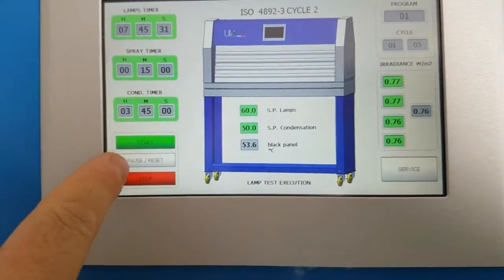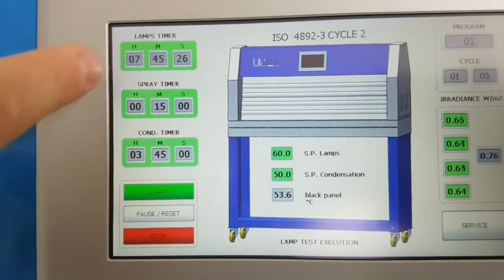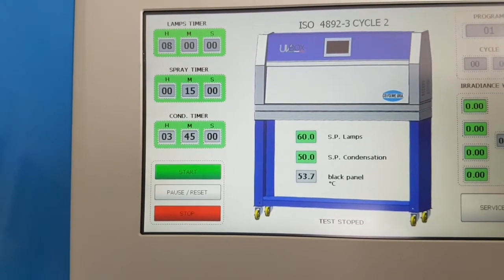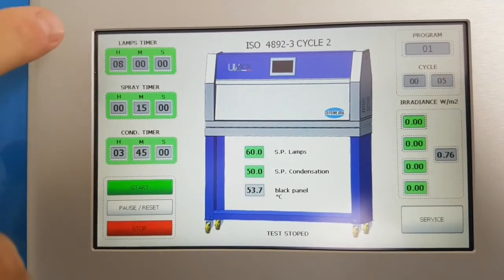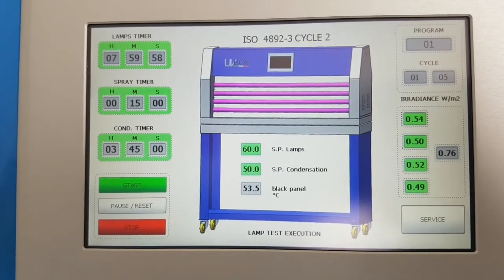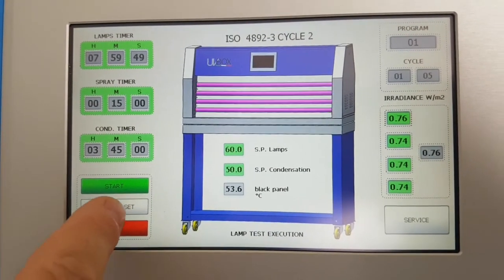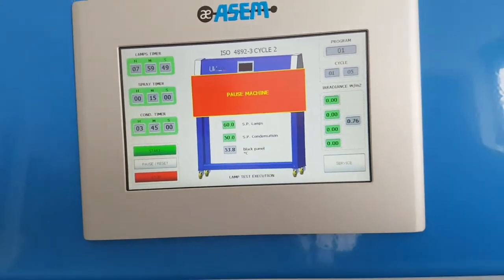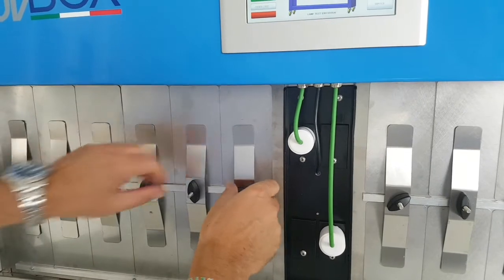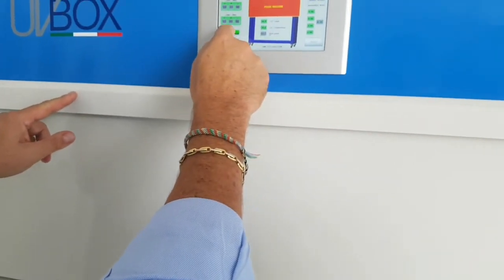You see Start, Pause — if you want to pause the machine you press pause and then can restart; the timer will stop and then restart automatically. If you want to stop, press Stop — the cycle is stopped and the timer returns to the beginning, so take care when using Stop. If you just want to check the sample, use Pause, open the chamber, inspect the sample, close it, and then start again.